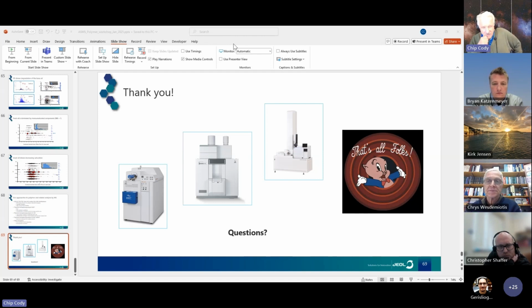Another nice thing about it, some people actually propose it as a kind of complement to FTIR, because the compound classes group in different regions on the 2D chromatogram. And so the location on the chromatogram might tell you something about what functional groups are present. Nice.